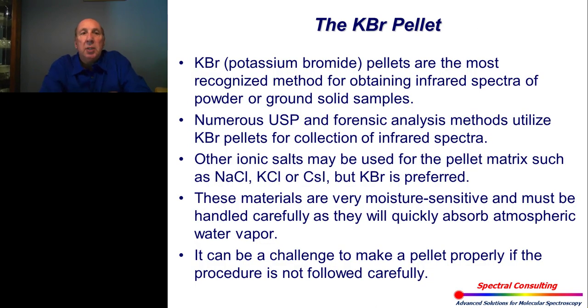The KBr pellet is the most recognized method. I think everybody that's ever done undergraduate chemistry and organic class has done a KBr pellet. At least I hope so. Because you learn a lot trying to do that. It's not the easiest method, but it gives you very good sensitivity. And once you've mastered the ability to make a KBr pellet, everything else is much easier.